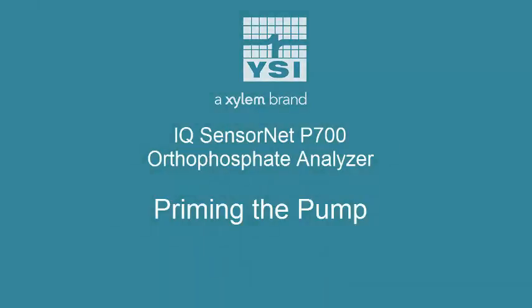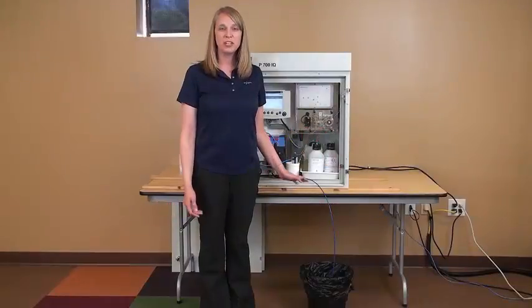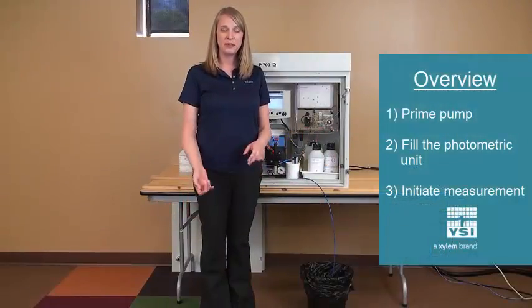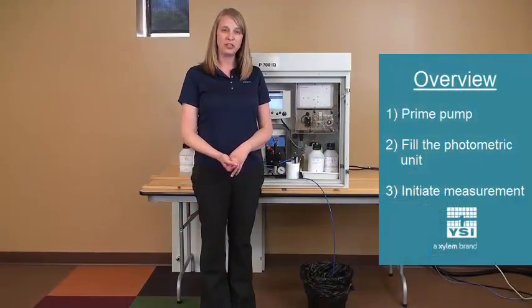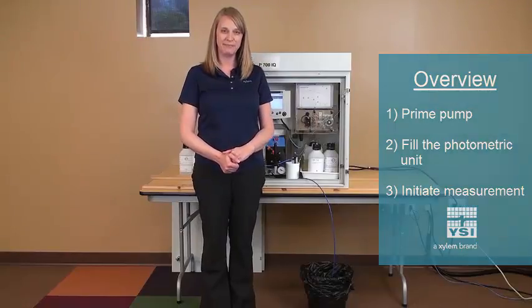I'd like to show you how the P700 works now. First, I'm going to prime the pump, then I'm going to fill the photometric unit, and then I'm going to initiate the first measurement.